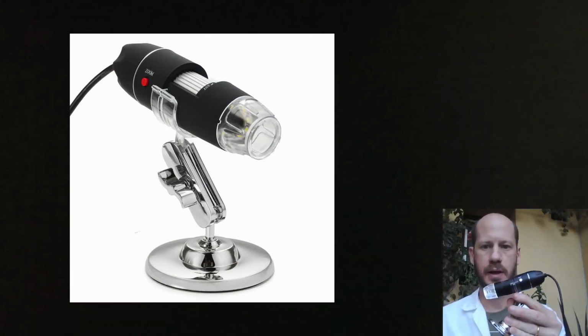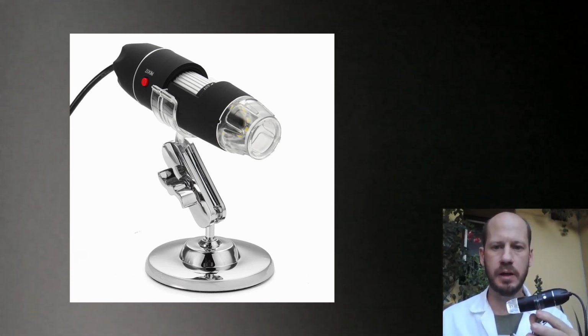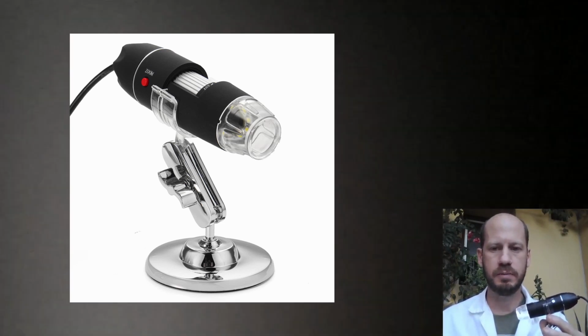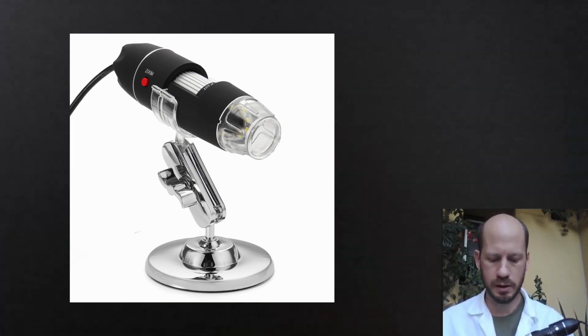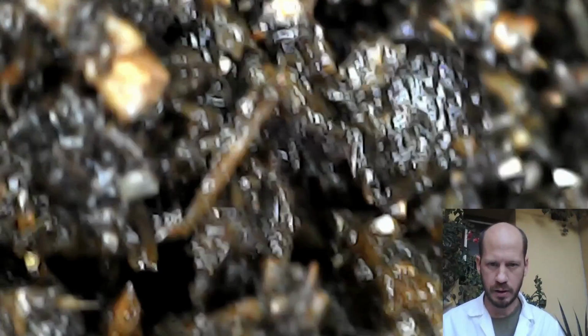This is a light microscope, but it's a digital microscope. Very cheap. You can buy this online in many places. AliExpress is about 3 or 1 reals. There's better and worse qualities, but in general, you can buy very cheap, and this is very useful for observing mesofauna in general. And I will show you some soil here very quickly, just so you can see how good the quality is for this type of material.